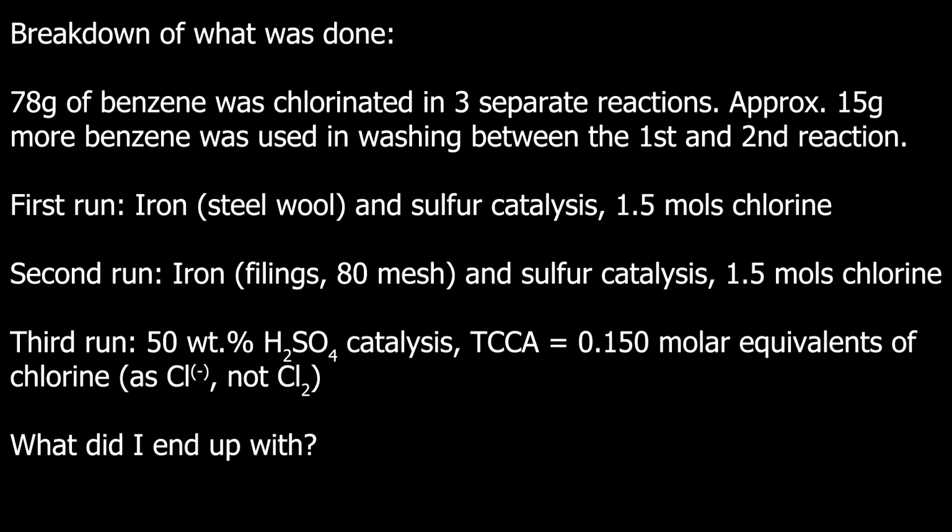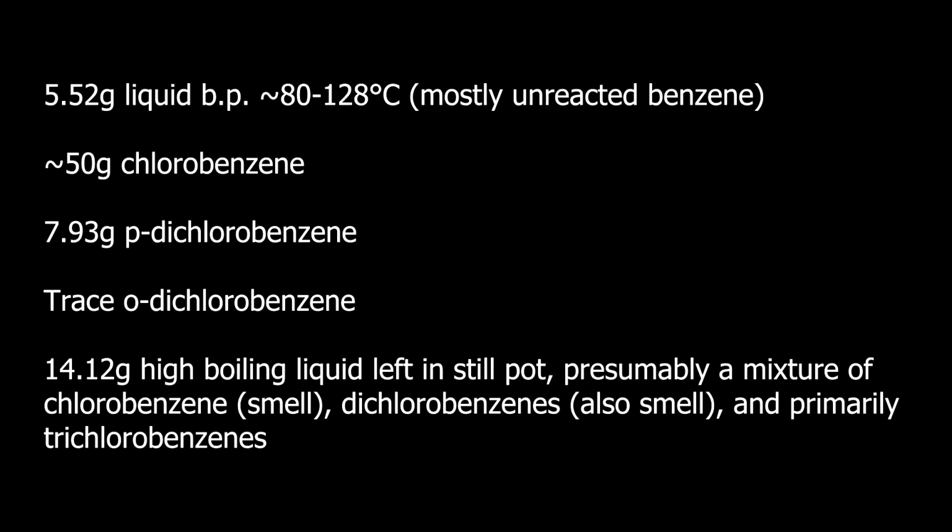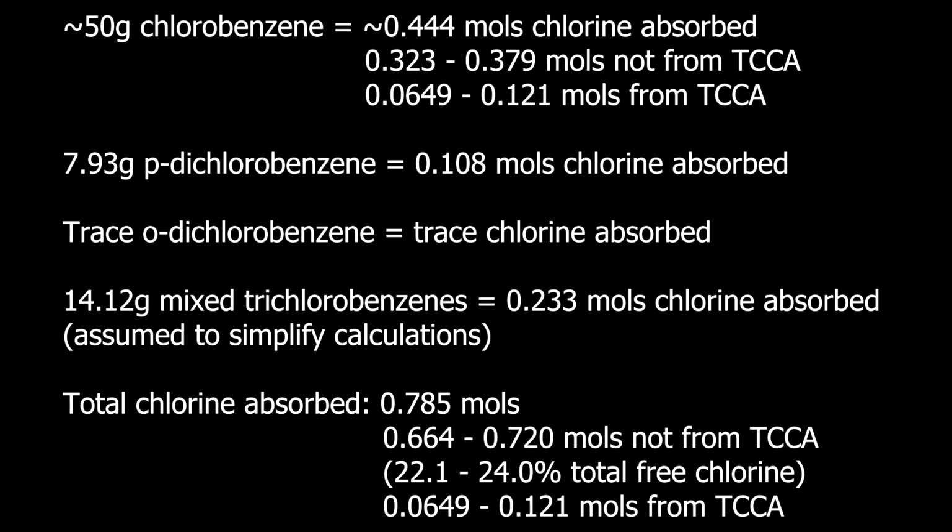Due to the corrupted footage, I summarized what I did just to make it 100% clear, or try to at least. I did a second run of the TCCA sulfuric acid procedure, but I only got a 42.9% yield of chlorobenzene, not the 80% reported yield. I let the temperature get too high, which was obviously my fault, but I was using a different heating mantle and didn't babysit it well enough, so that definitely lowered the yield. I didn't feel like doing it again, so the range of the yields is factored into the calculations of chlorine absorption.